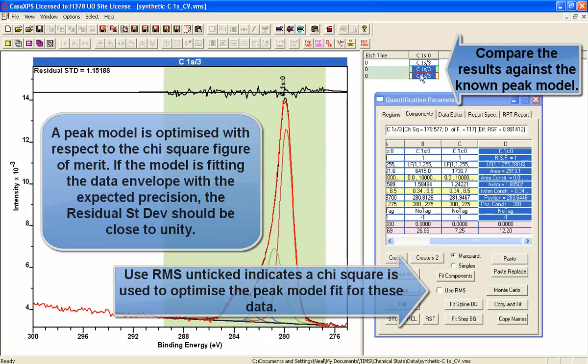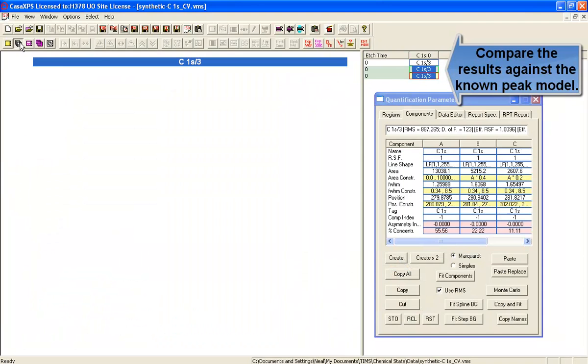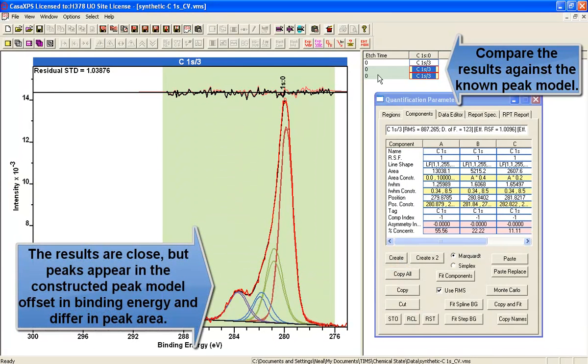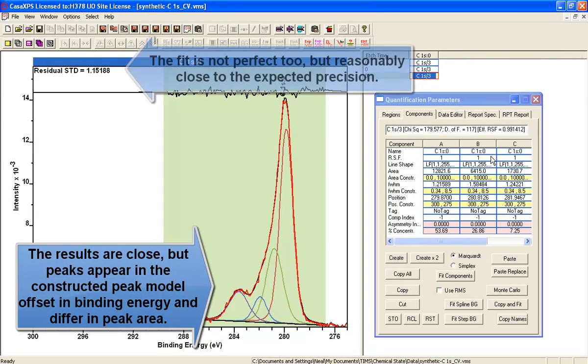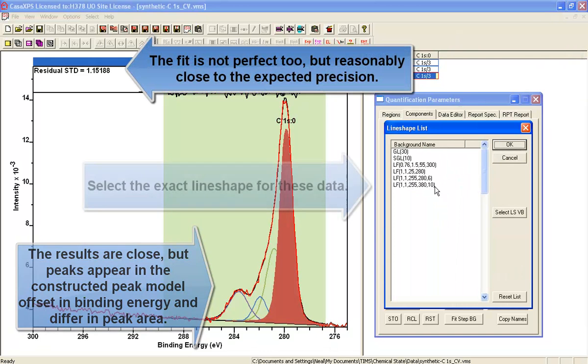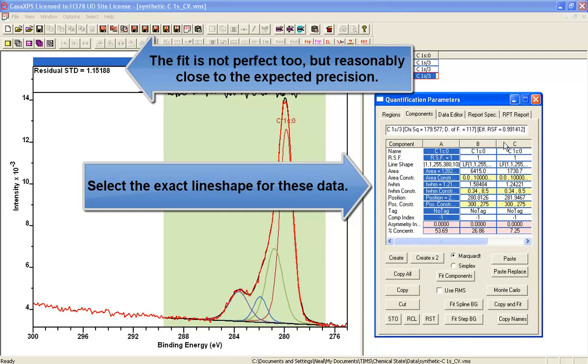But nevertheless, it's a pretty good standard deviation. So let's do a comparison and see how well we did. And the answer is, well, we did reasonably well, but it was not as well as the standard deviation would suggest.